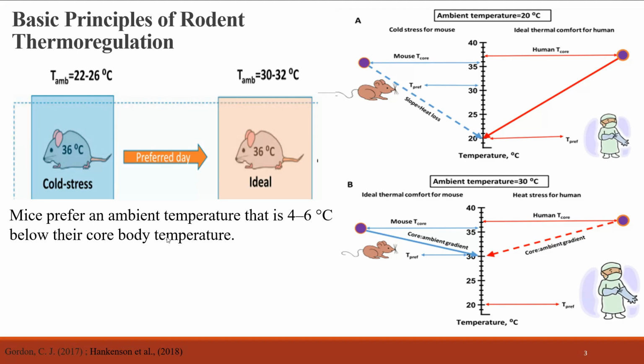So, the overall keynote of this first slide of the presentation is that even before the animals are administered general anesthetic, they are experiencing cold stress, and that is why animal warming is very important. Here, the best practice of pre-warming the animal will immensely help in bringing the animal into a normothermic range so that the animals are not stressed even before they are subjected to anesthesia.